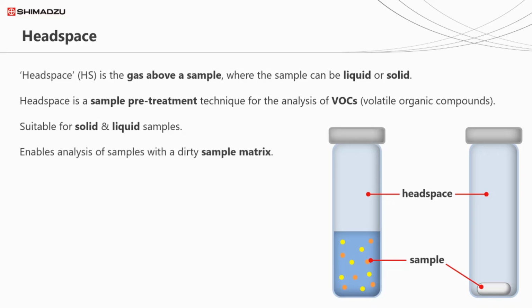In chemical analysis, the sample matrix refers to anything in the sample that isn't of analytical interest. A sample's matrix will obviously depend on the sample itself, but it's also subjective and will depend on the analytical outcomes. Two different analysts might see the same sample as having very different matrices.